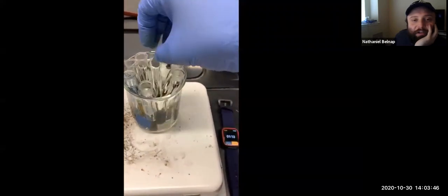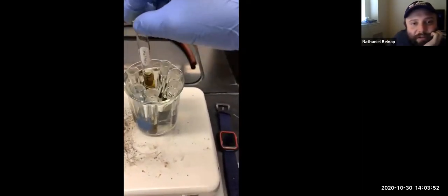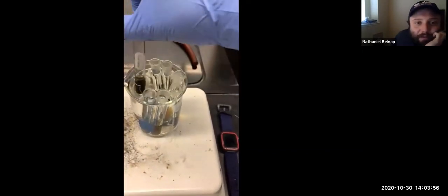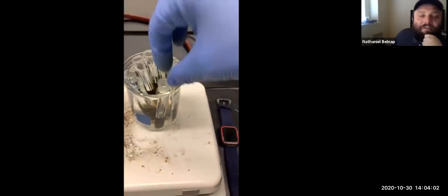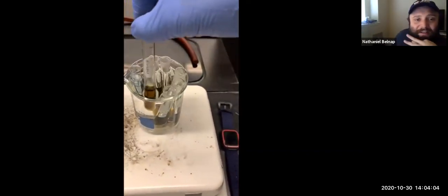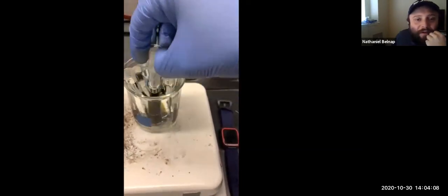Ours is like a deep yellow. I think that's fructose. I'm hoping he puts them on a rack where we can just look at them. Xylose looks like a deep blue, I think. Glucose looks like a deep, golden yellow. I think that's, I don't know, I can't read that writing.